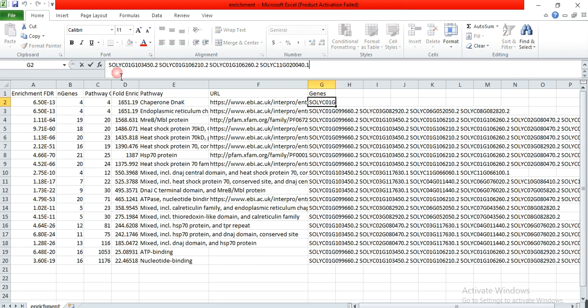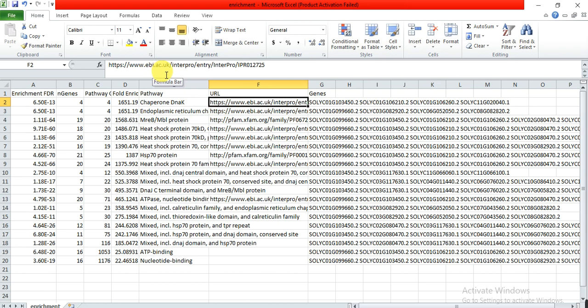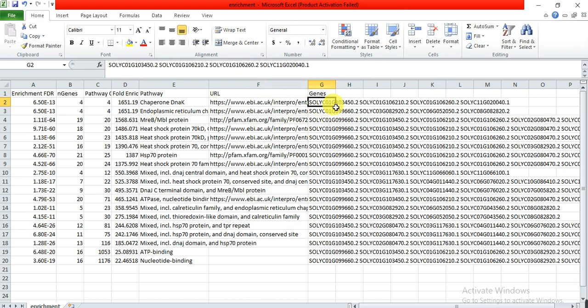These four genes belong to the chaperone DnaK pathway, and this data they have got from this database at ebi.ac.uk InterPro entry.